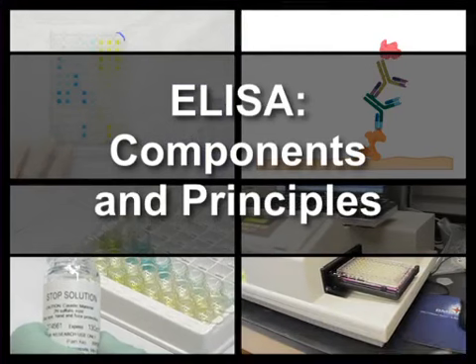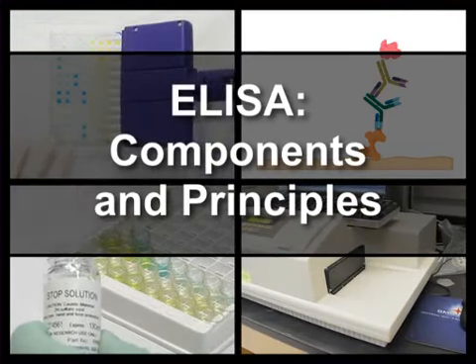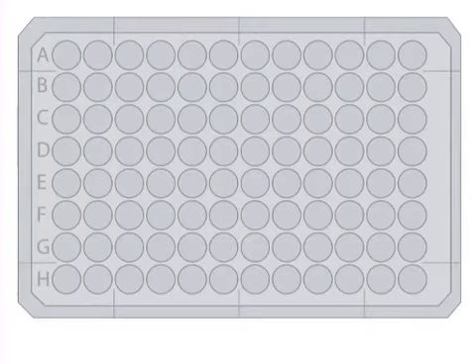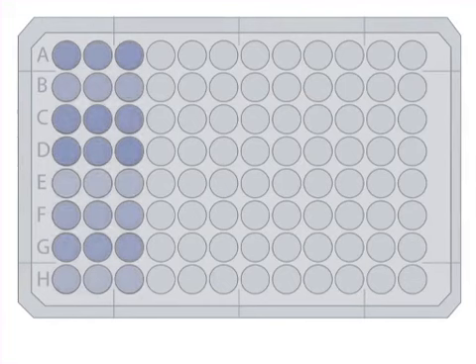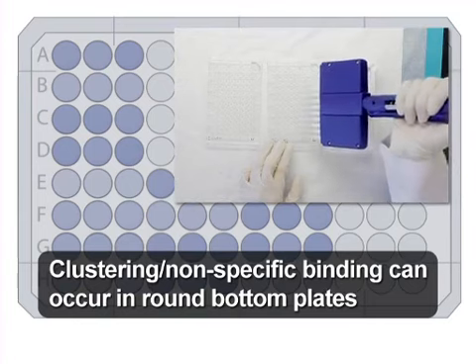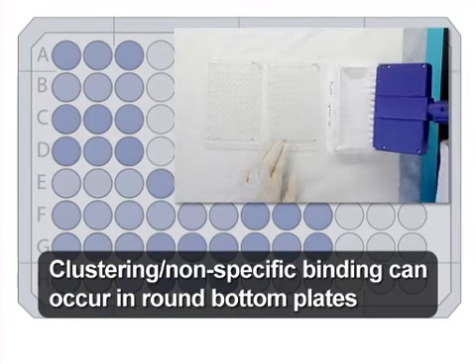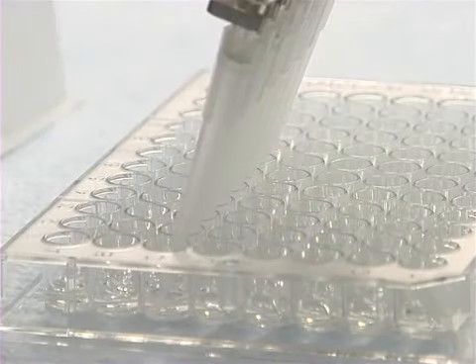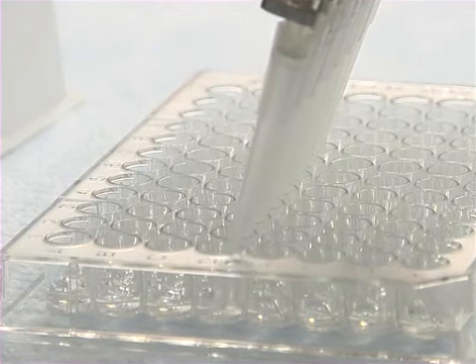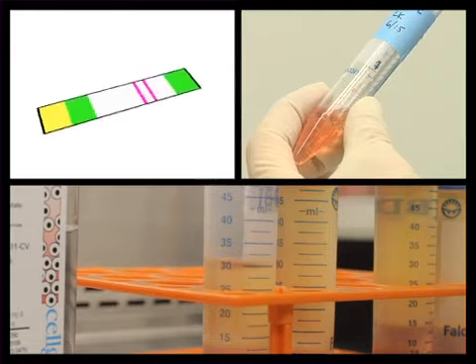Before we discuss how to perform an ELISA, let's get familiar with the equipment and reagents that you'll need. The setting for an ELISA reaction is typically a 96-well flat bottom plate. The flat bottoms of the wells will help facilitate an even distribution of your experimental sample, as well as your capture and detection antibodies. ELISAs detect the presence of specific target proteins in experimental aqueous solutions. Urine, cell culture media, and serum are common experimental samples.